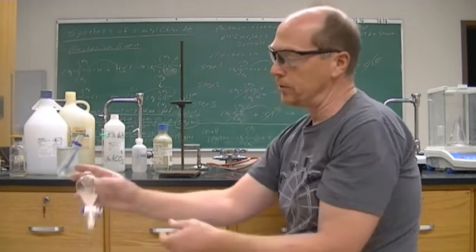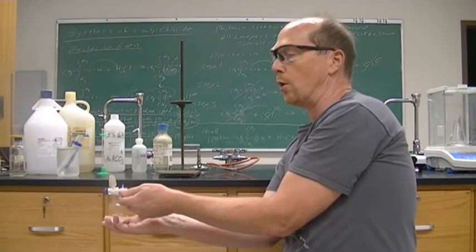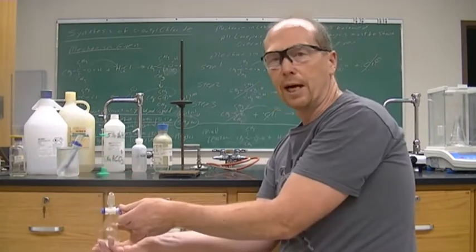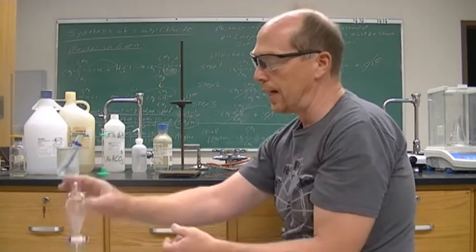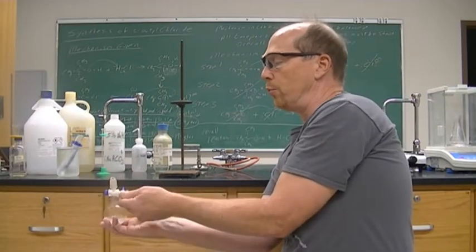But now we're making t-butyl chloride, and so there's no hydrogen bonding. And so now it is a relatively non-polar organic. It is not going to be soluble in water. And so we're going to end up with 2 layers.